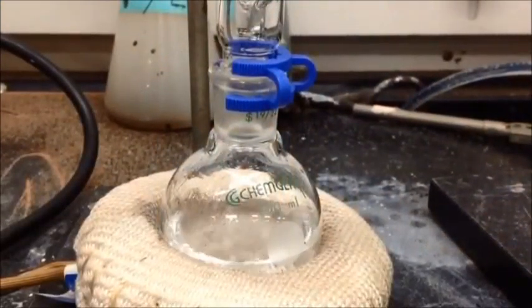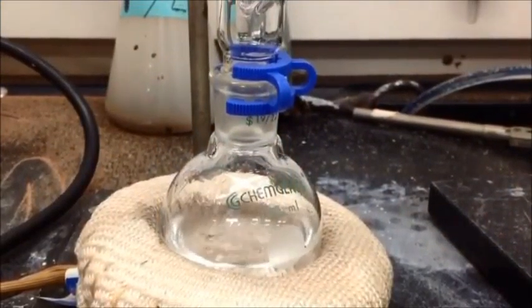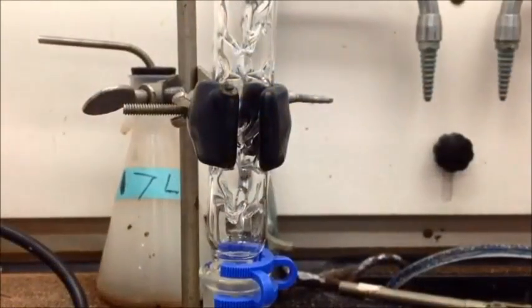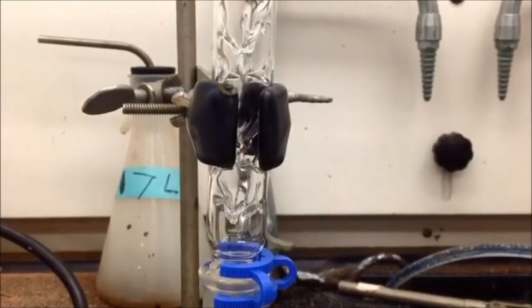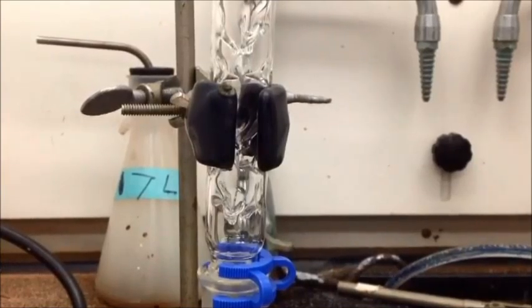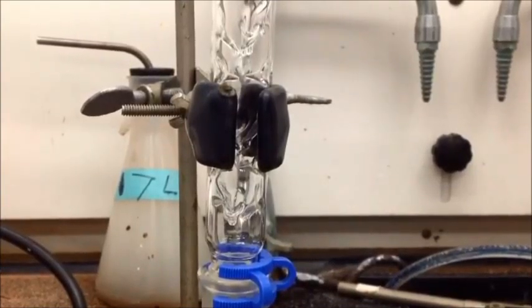Once one of the liquids begins to vaporize, it's going to move up through the distillation column, which is essentially a long glass tube with a bunch of pegs inside. The vapor will actually condense one time within this tube before evaporating again and moving through the rest of the system, so the pegs collect the excess vapor and make sure that all of the liquid ends up back in the round bottom flask.